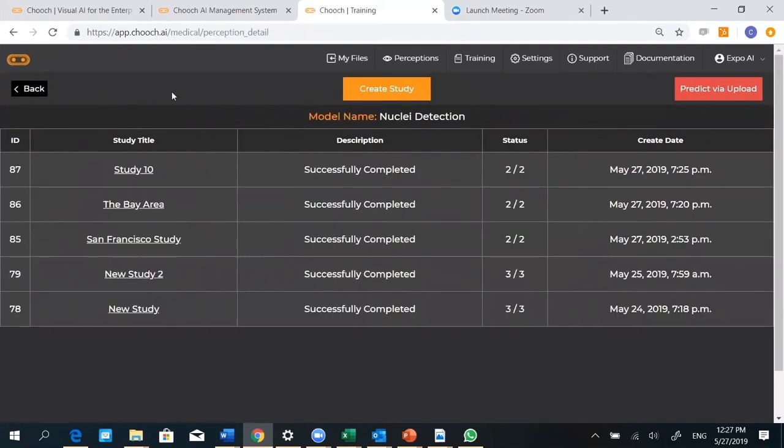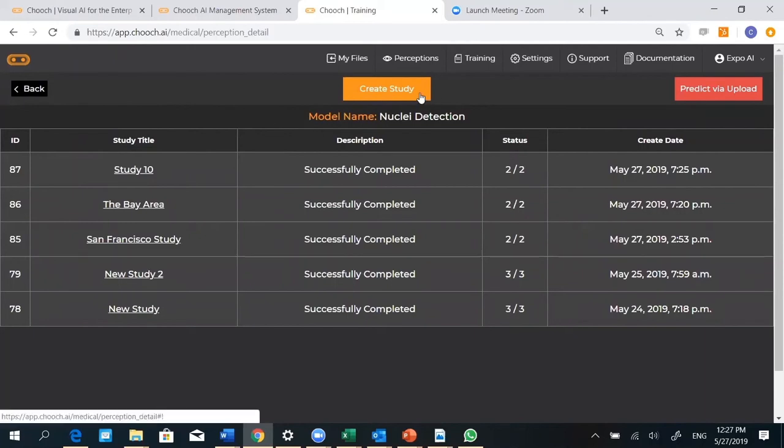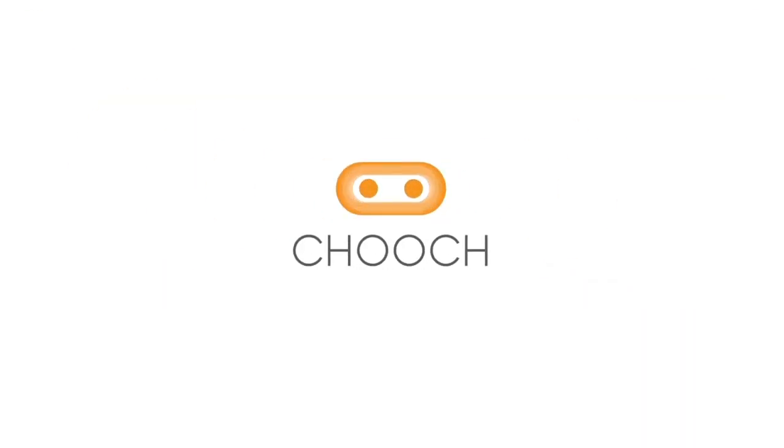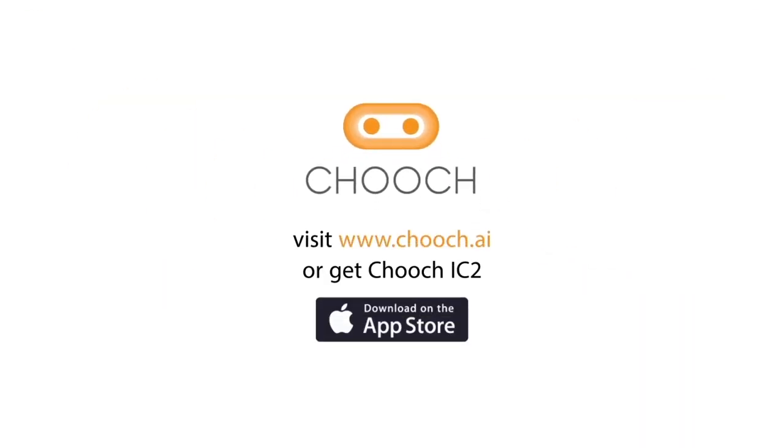And you can create as many studies as you wish over here.